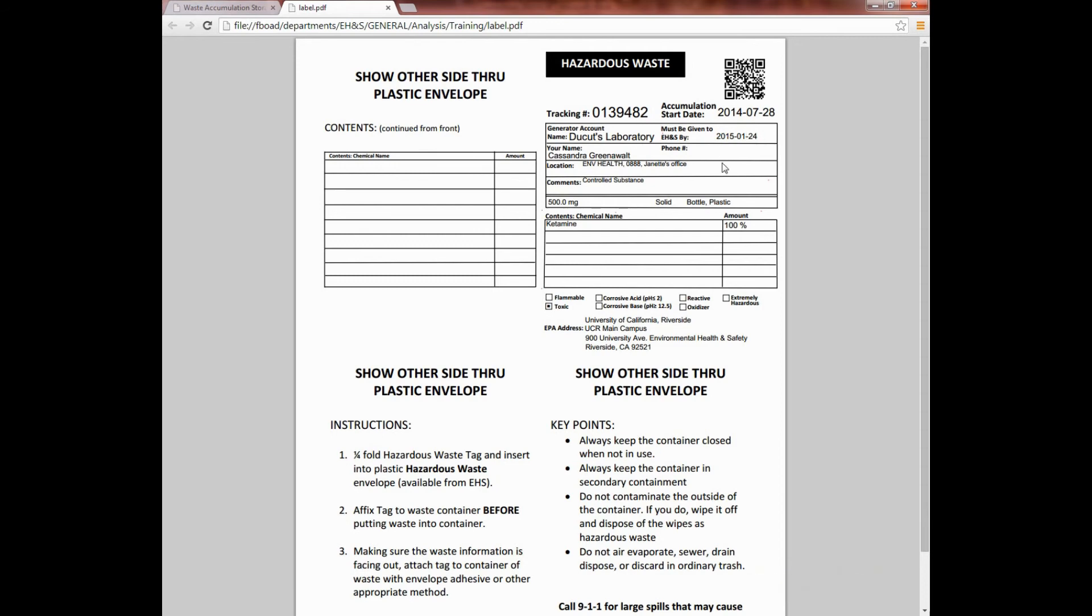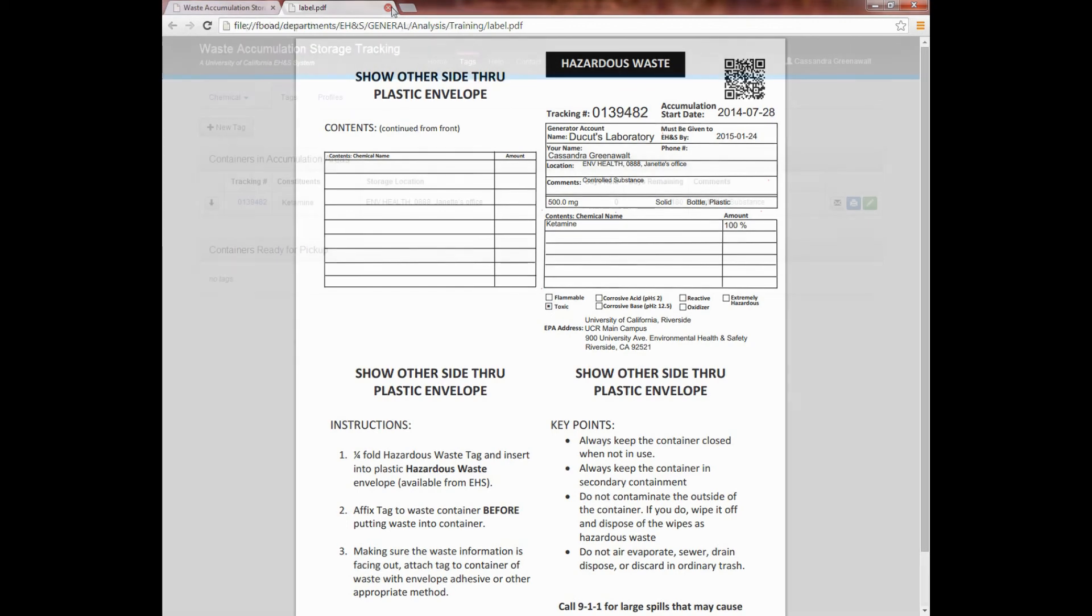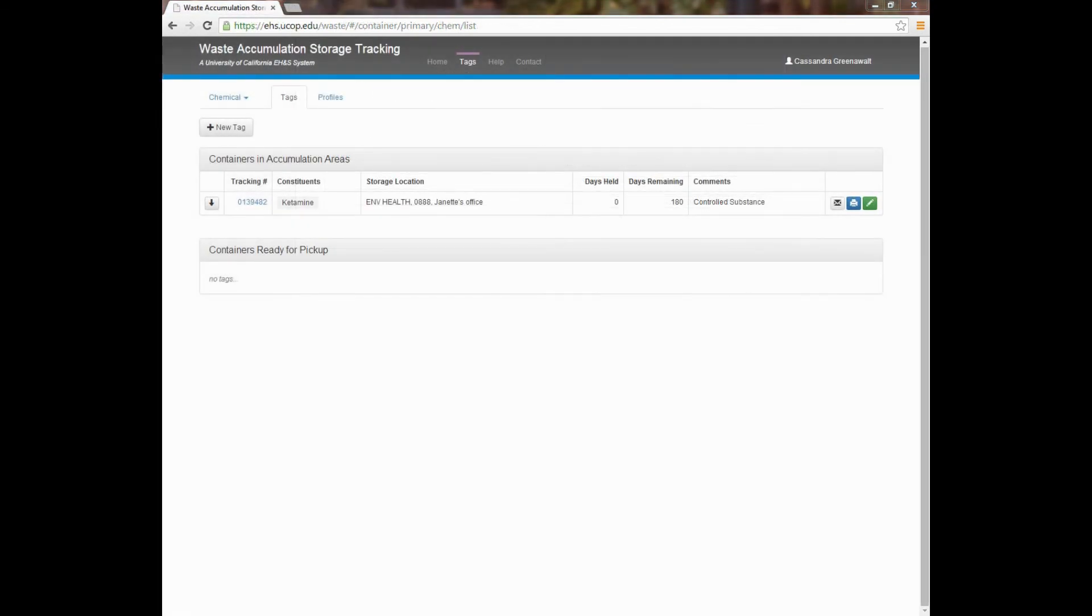You can always return back to the system to modify the tag and then reprint it if necessary. Please note that once you click on Save, you cannot later delete the tag. It can only be modified or deleted by the EH&S administrator at your campus. For more information, contact Environmental Health and Safety or email erm.ucop.edu for assistance.